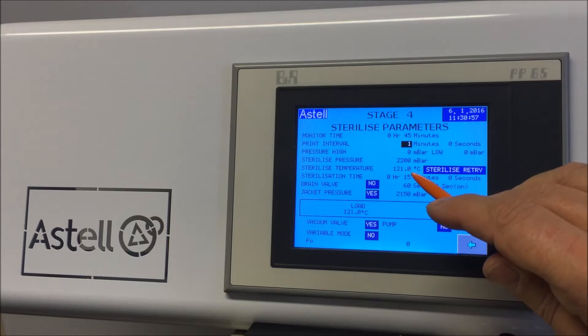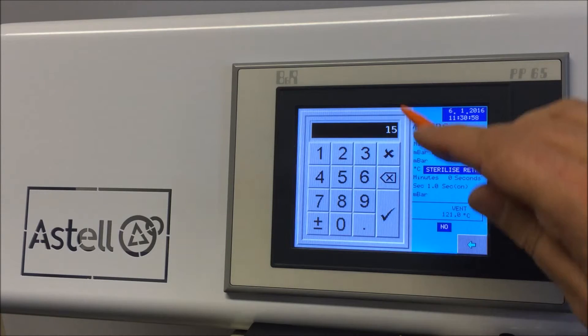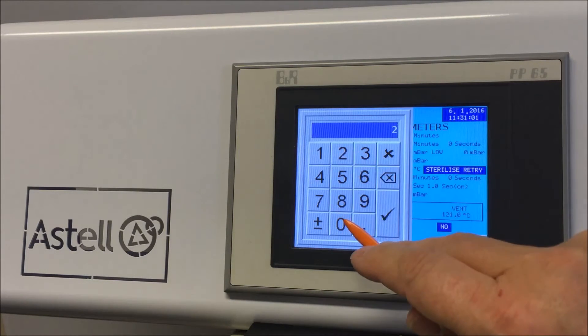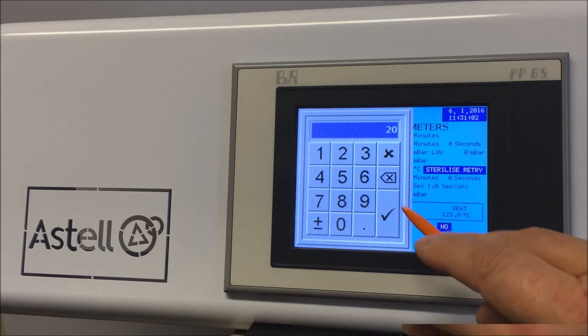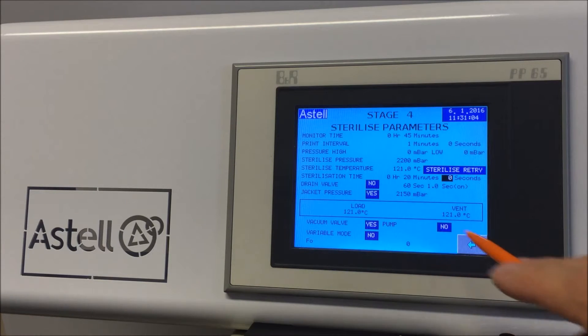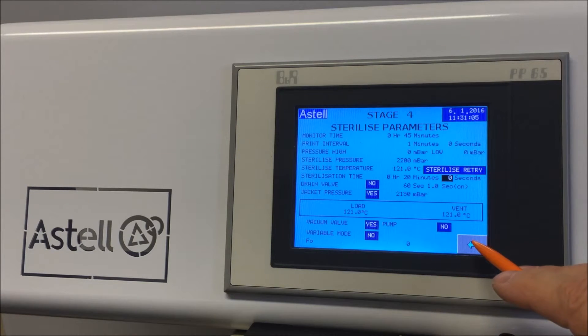This will give you a numerical pad. Change the time to 20 minutes and select the tick to confirm. You can now see the sterilization time is set to 20 minutes.